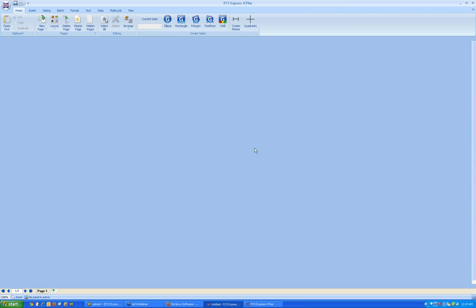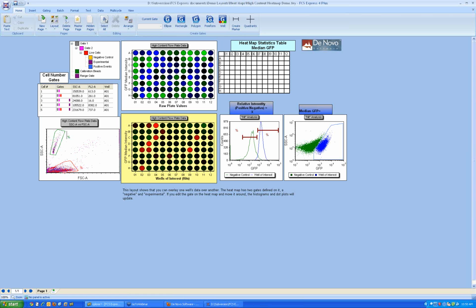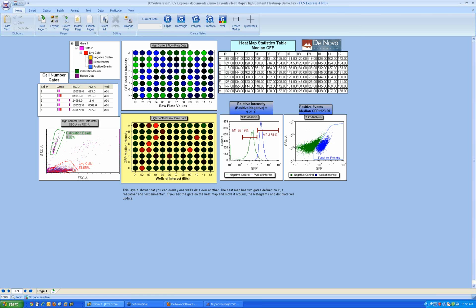data. And I just do want to show just a little bit about how the heat maps are working. I think this might be from an imaging file, so it might be taking a little bit to load up. So that'll be a second. The heat maps are actually very powerful. You can actually plot, here's an example. Again, this is from an imaging analysis, so it's kind of, oh no, this one's from a flow. This is actually cool. This is perfect.